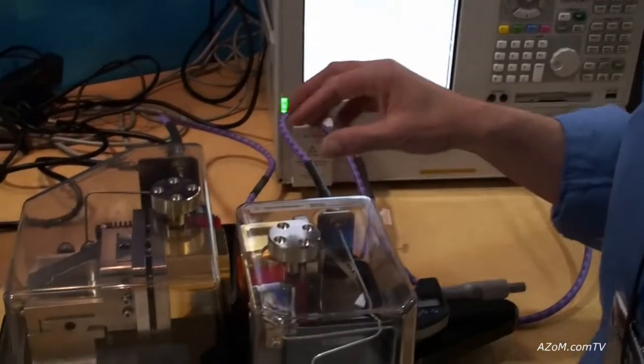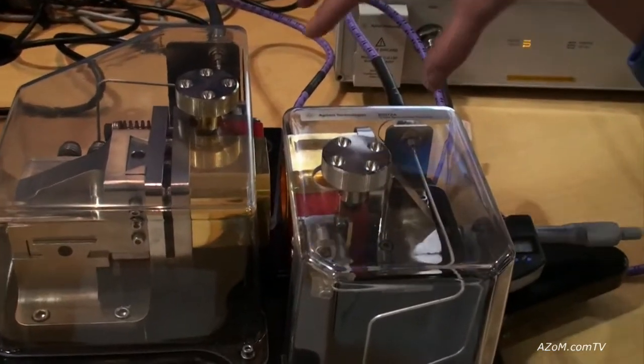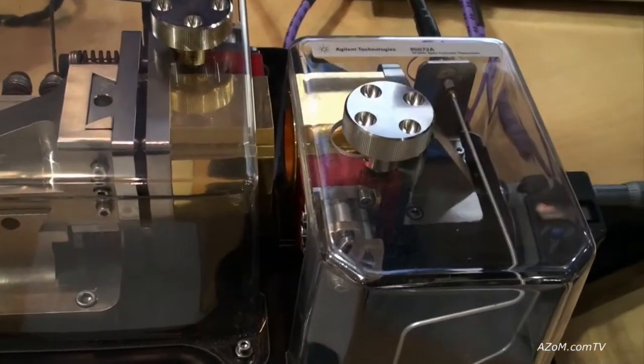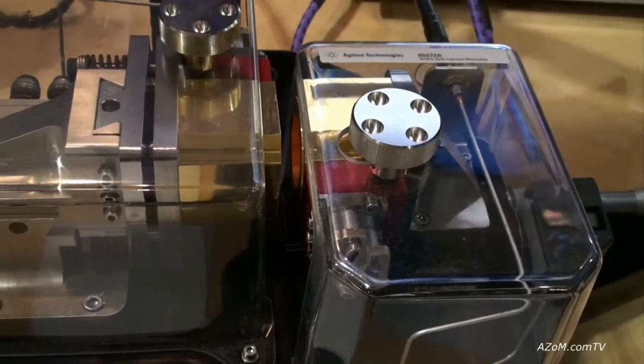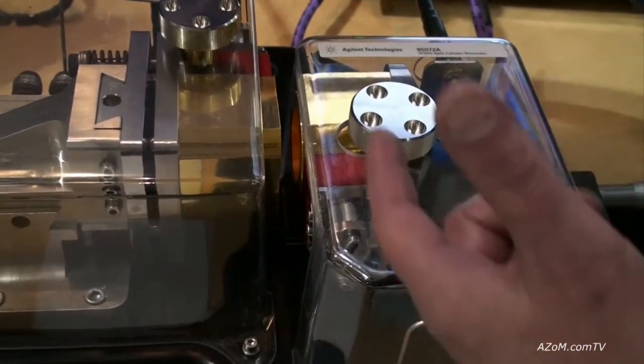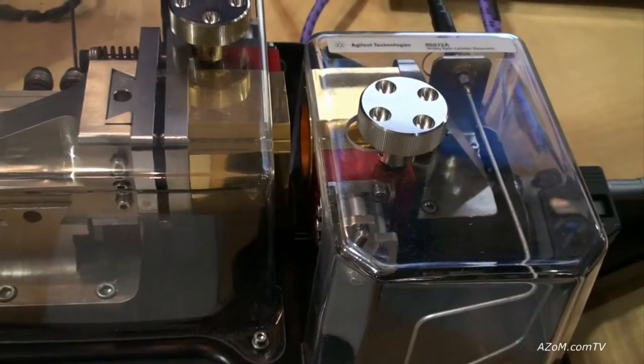So if we look at the fixture, it's a couple of very finely machined cylinders. We have the energy coming in from the network analyzer to coupling loops through holes in the sides of the cylinders.